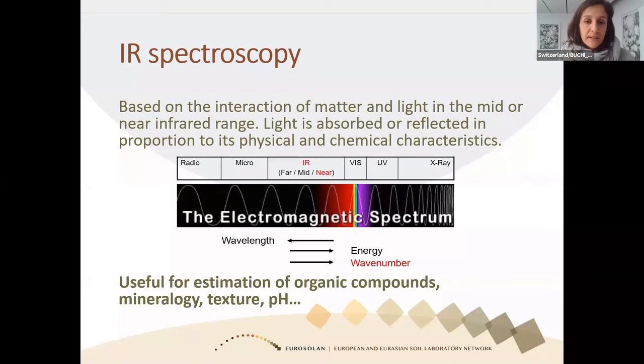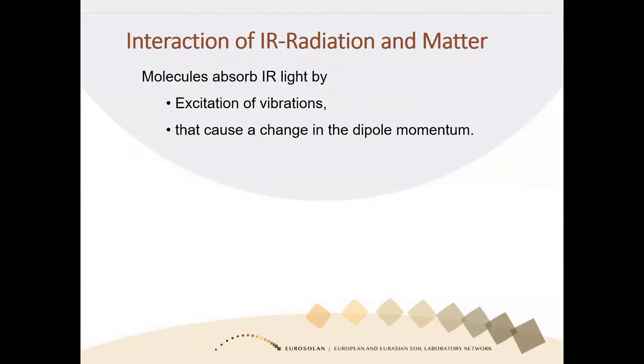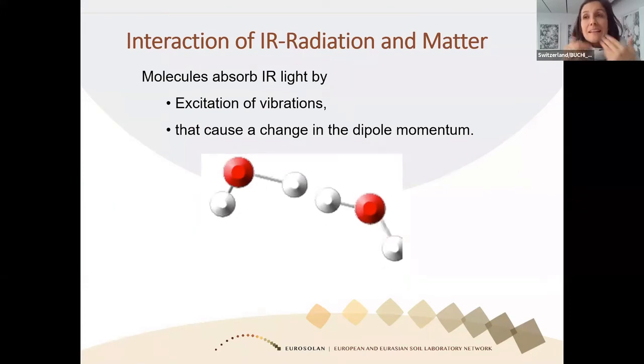When the light and matter interact, the light can be absorbed or reflected by the sample in proportion to its physical and chemical characteristics. And the technique is useful for estimating organic compounds, mineralogy, texture, pH. There are of course differences between the two techniques. But basically, the bonds between atoms that form molecules, that form matter or soil, when they are irradiated by infrared light, these bonds vibrate, and this causes a change in the dipole momentum that leads to this absorption of light.